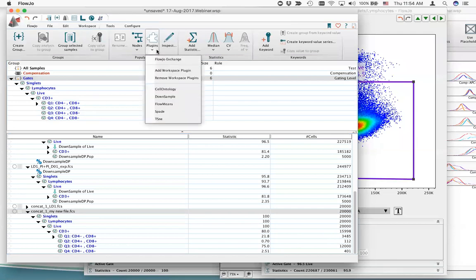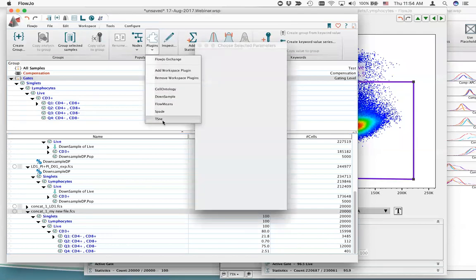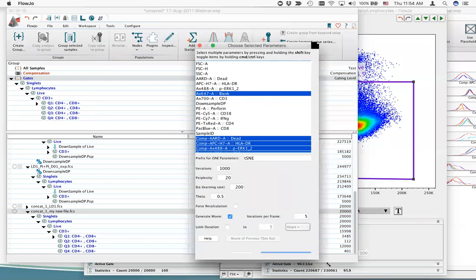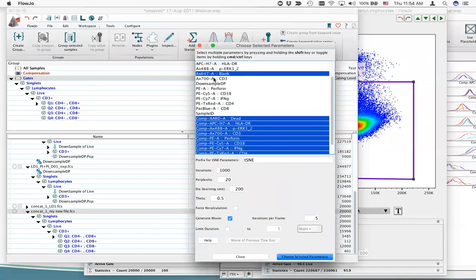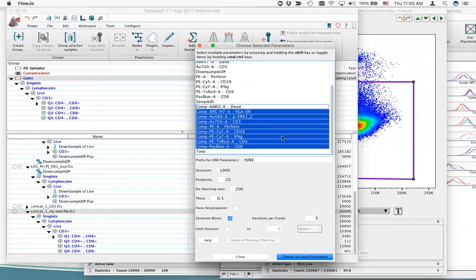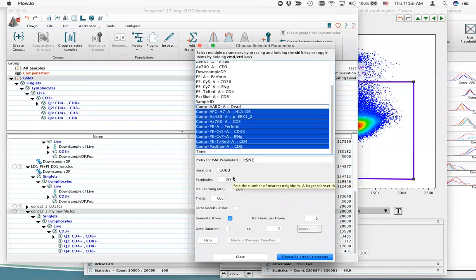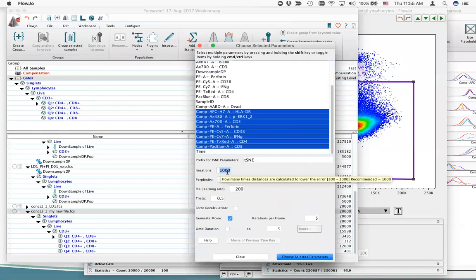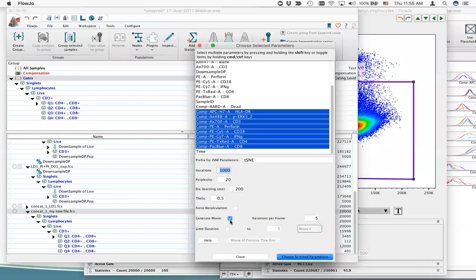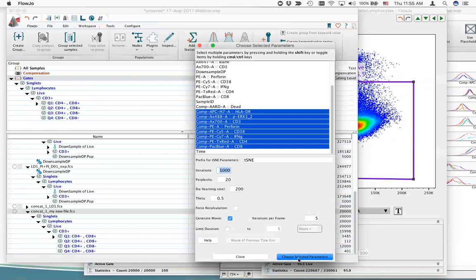Now I have a new file called 'concat1 my new file' with the same parameters and group-owned gating — it gets all the gating. This 20,000-event file can be used to initiate t-SNE by going to workspace tab, plugins menu, selecting the t-SNE algorithm, and selecting within the menu all parameters for dimensionality reduction. Don't use blank or live/dead parameters. Scatter parameters might be useful depending on what populations you're interested in. Select iterations and perplexity — start with 1,000.